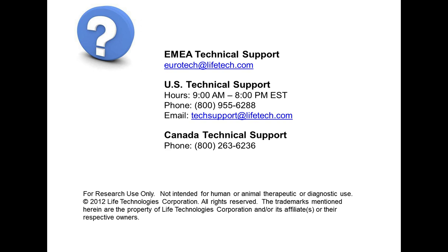So there was a question about the nomenclature for Alexa Fluor dyes and what is the excitation or emission wavelength. Alexa Fluor 488 is named based on its excitation wavelength, not its emission wavelength.